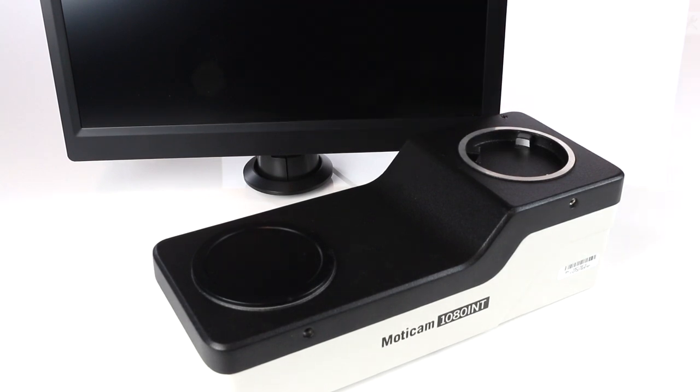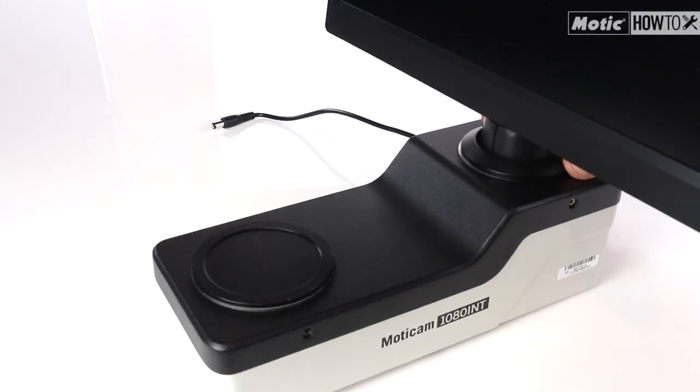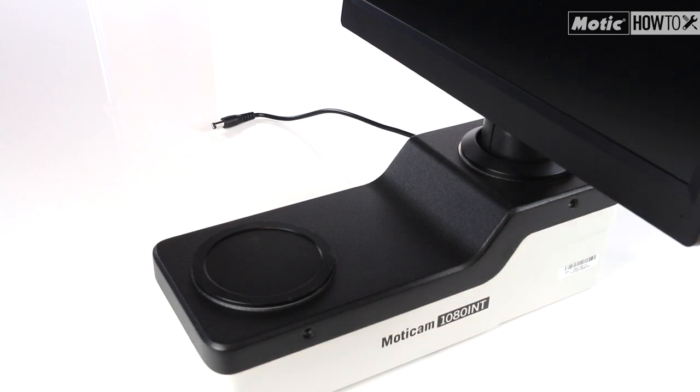Let's assemble the screen on the camera. Place the screen on the rear part of the camera and hold it by tightening the fixing screw with the Allen key. Once done, we may proceed to fix the system to the microscope.